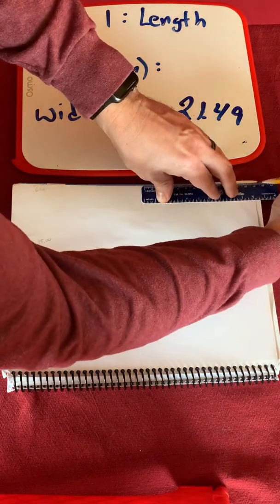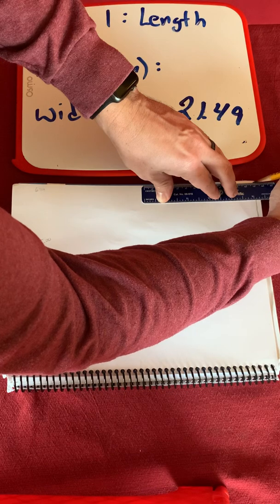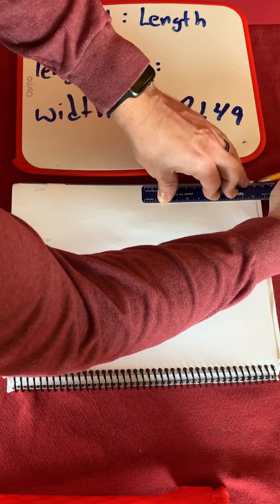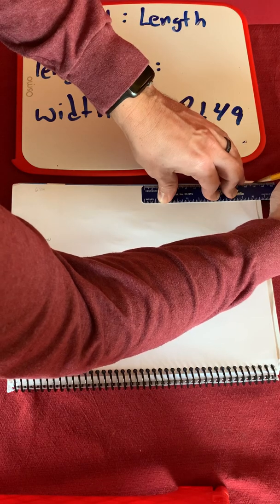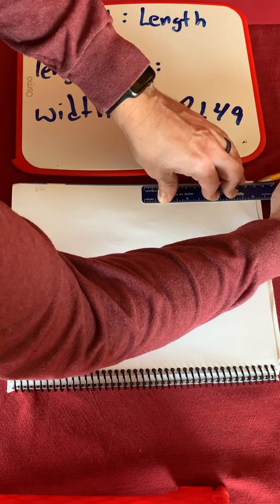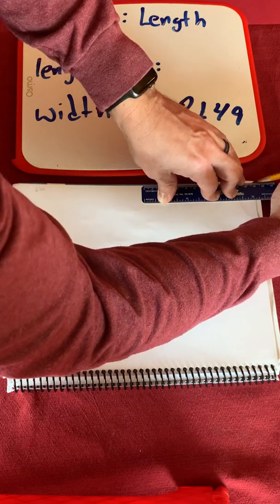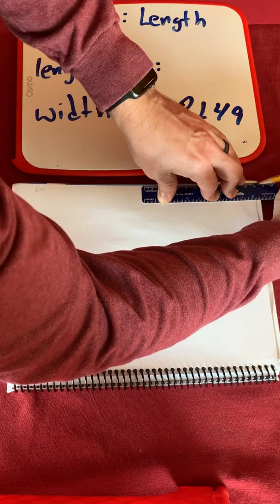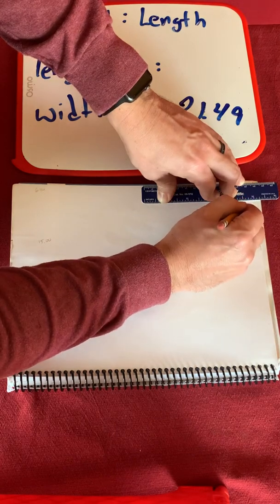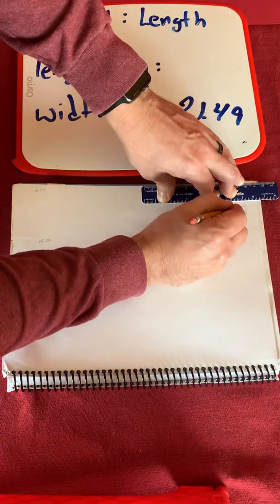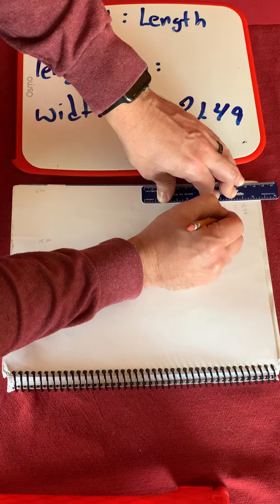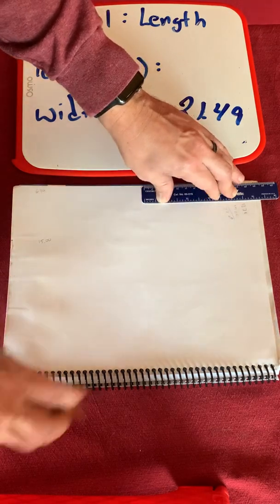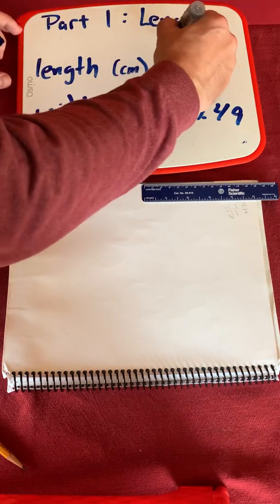That's right here. You can see where my pencil is, and that's going to give us 12.79. All right, so now 12.79 plus our 15 gives us 27.79 centimeters.